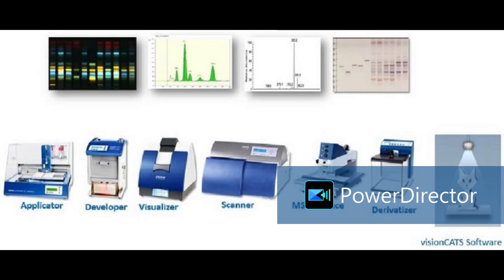And multi-wavelength scanning, as I said, suppose the molecule is not absorbing at 254, 366, 548, then what will we say, that it is not there? No, that is the wrong effort. What to do? Take that plate, keep it in the scanner and use the multi-wavelength option.